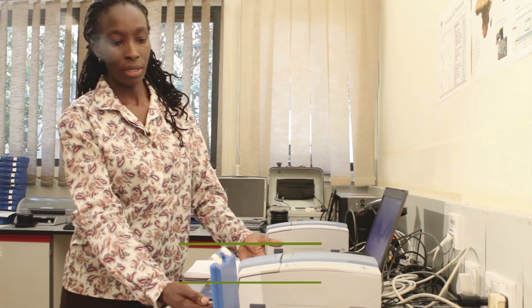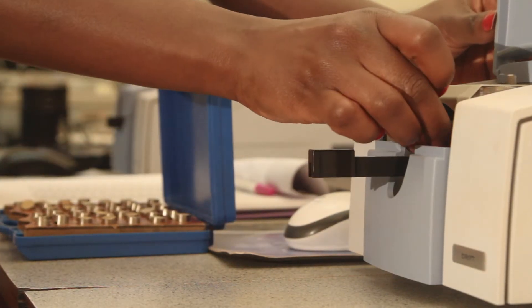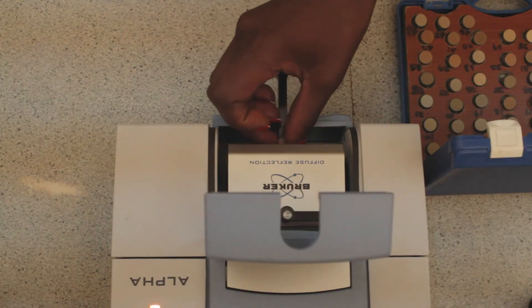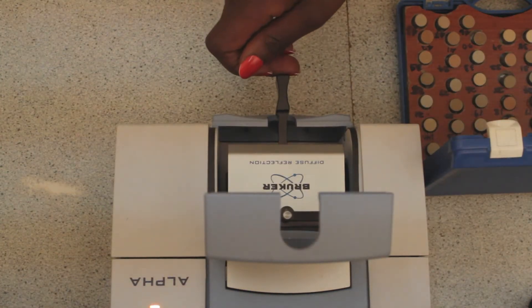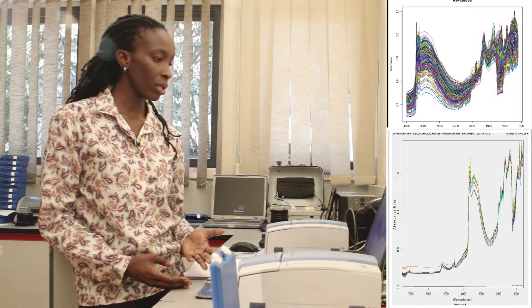This instrument here operates in the mid-infrared region. We shine light on a sample and within 30 seconds we have a spectral signature, which is a unique fingerprint indicating the full health status of that particular sample — whether it's the physical properties, the chemical properties, mineralogical properties, or biological profiling of that sample.